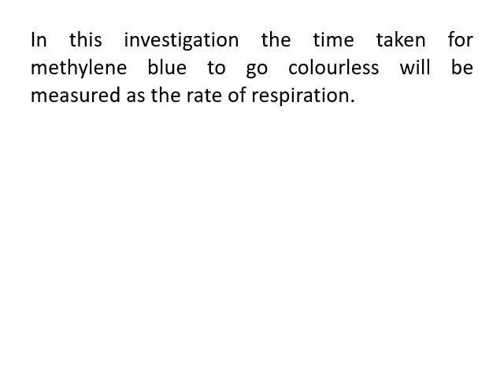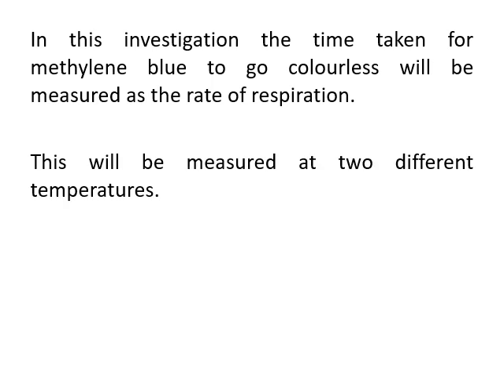So we will measure the time taken for the methylene blue to become colourless. So we're going to take yeast, we're going to ensure that it has access to oxygen, so it's doing aerobic respiration, and we're also going to give it a respiratory substrate. So we're going to give it glucose so that it can actually carry out respiration effectively. What we will vary though, so this is going to be our independent variable, is the temperature. We're going to use 2 different temperatures. One will be around about room temperature, and the other will be between 35 and 37 degrees Celsius, so just slightly warmer, closer to body temperature.